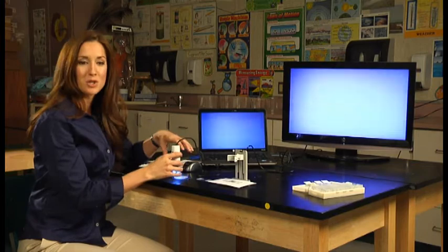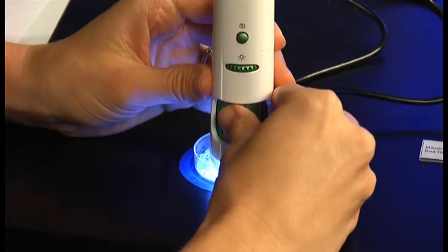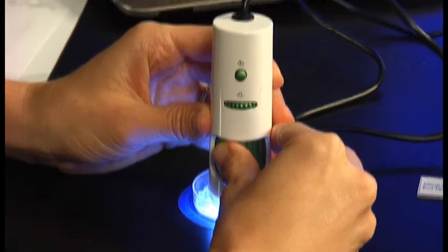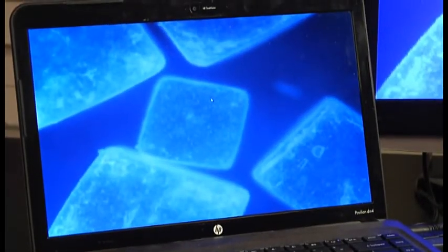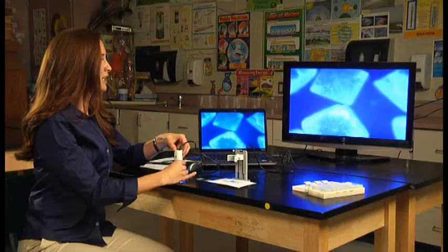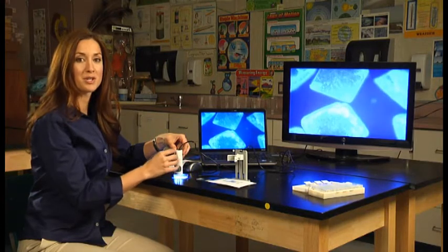Let's take a look at some traditional table salt. You can place it directly on the salt, and then use the focus dial to bring the salt into focus. You can see all of the textures. You really get such a clear picture.